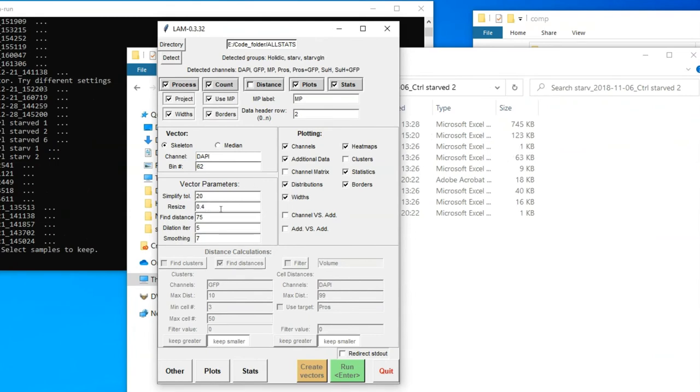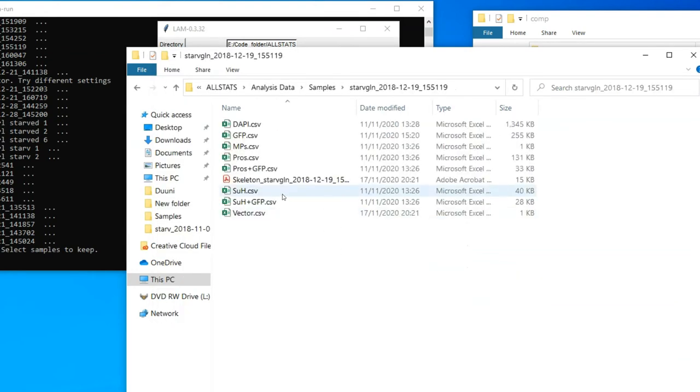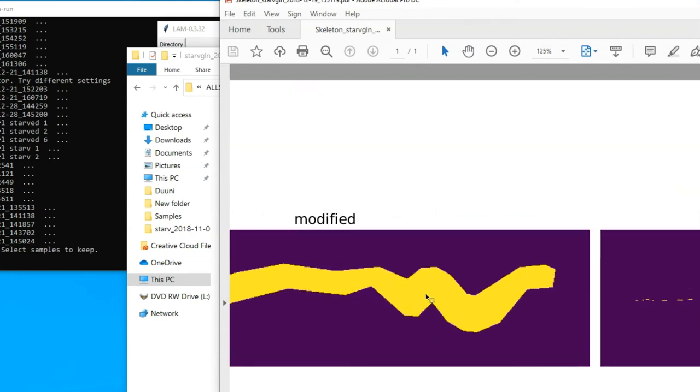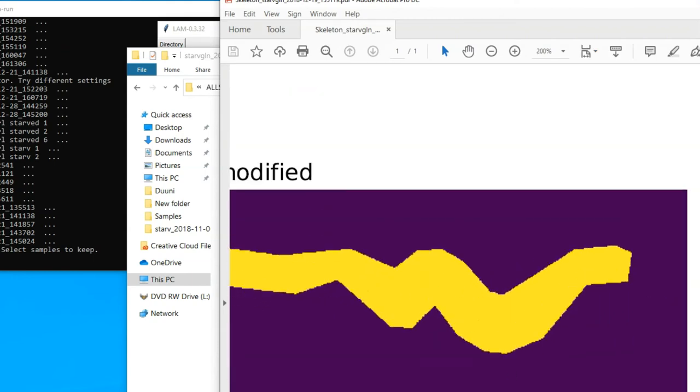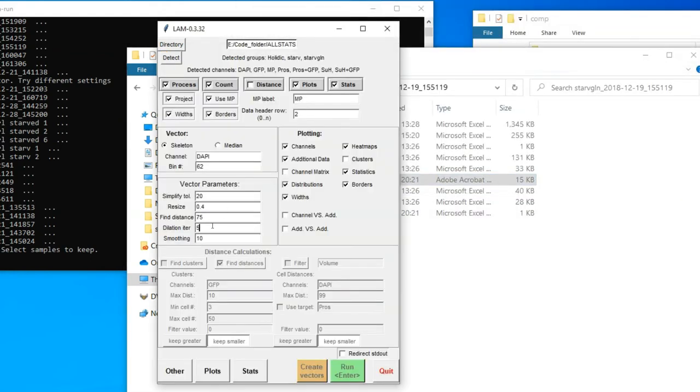Selecting a smaller resize value drops the number of pixels and makes skeletonization faster and more effective. Smoothing reduces roughness in the binary image and lessens branching due to more even pixel erosion. However, these parameters can cause nearby segments to fuse in the binary image when the sample is curved. In these cases, the binary dilation parameter can be used as a more gradual method for reducing branching.